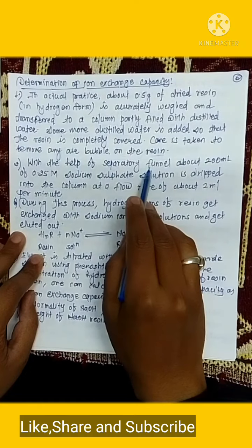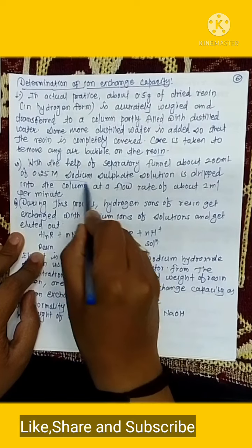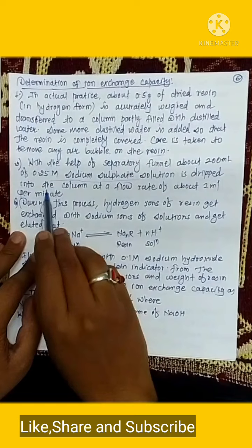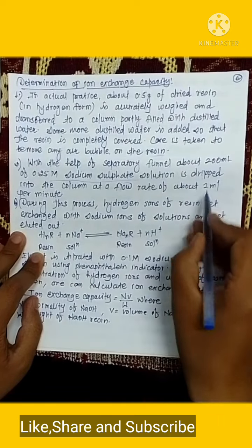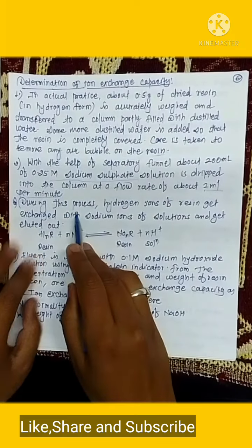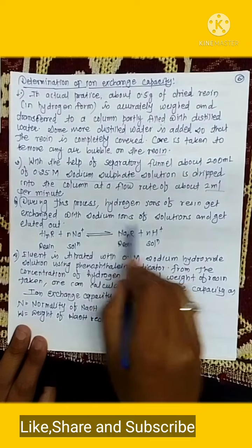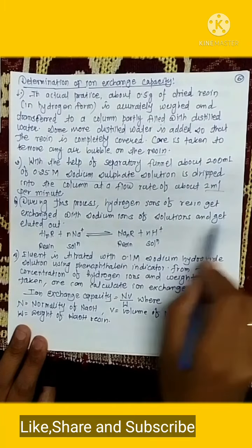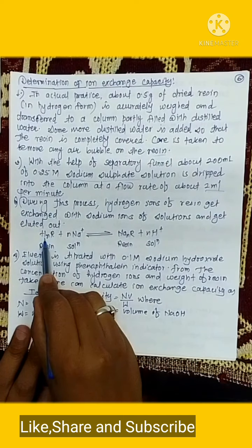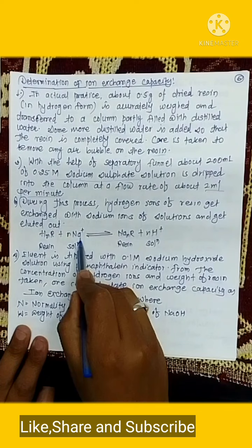With the help of a separating funnel, about 200 ml of 0.25 molar sodium sulfate solution is dripped into the column at a flow rate of about 2 ml per minute. During this process, hydrogen ions of the resin get exchanged with the sodium ions of the solution and get eluted. So basically, your resin is in the hydrogen form and your solution contains sodium ions.